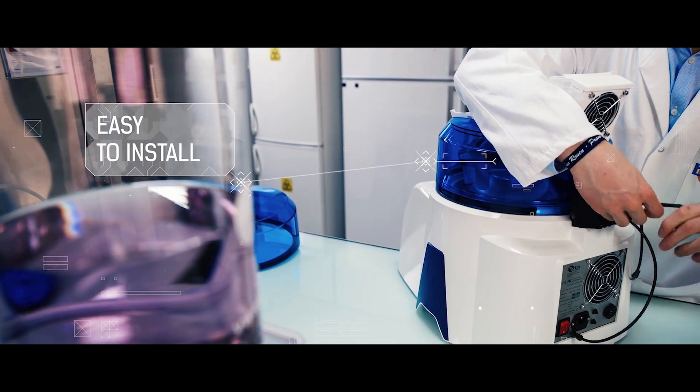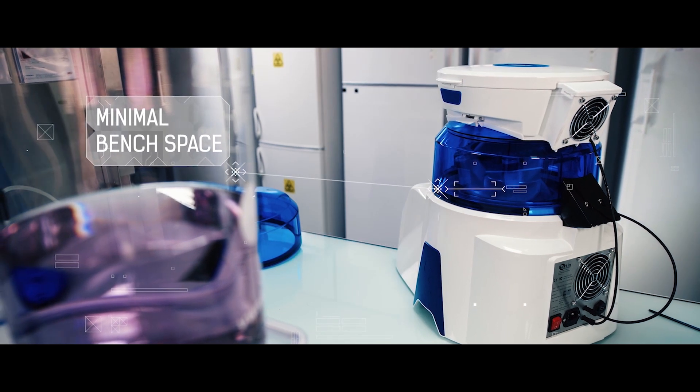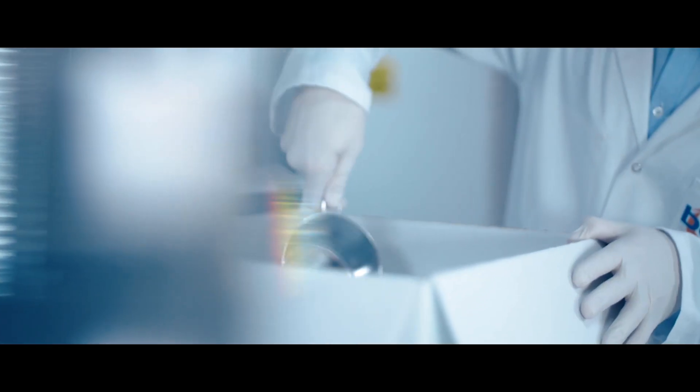Easily installed, freestanding, it is now a real extension of Pressilis Evolution, the best homogenizer on the market.